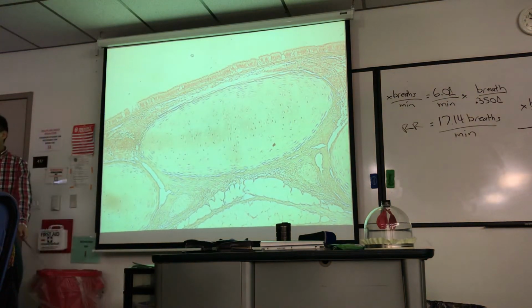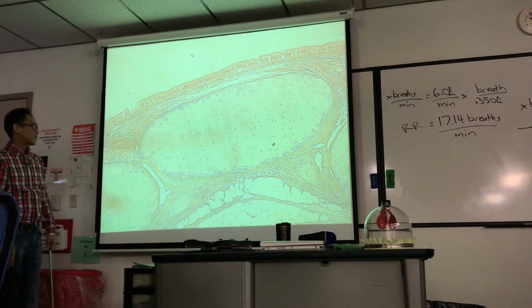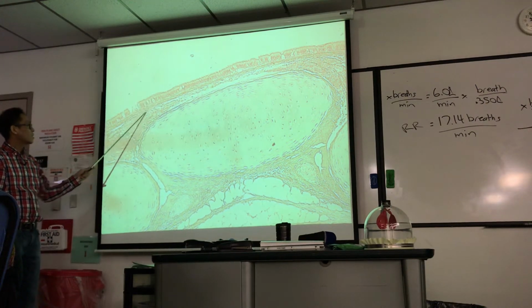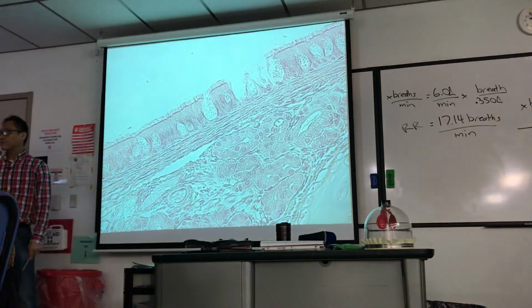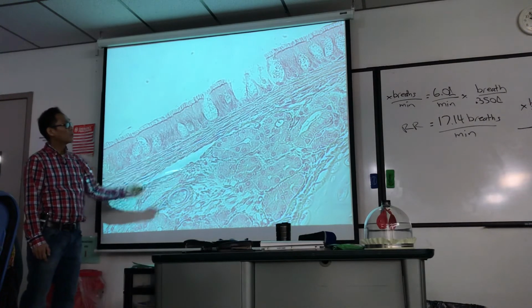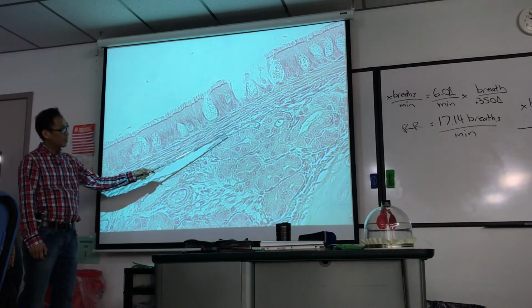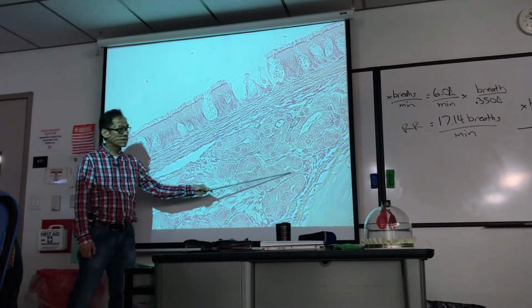Now getting to the respiratory stuff, which I haven't covered yet, but we talked about it within the lecture. If I said, identify this whole thing, trachea, okay? Mucosa, submucosa, adventitia. Here's a close-up, and this is mucosa. Identify tissue, that would be ciliated pseudostratified columnar epithelium with goblet cells. That's lamina propria. This is the submucosa, and these are all seromucous glands.